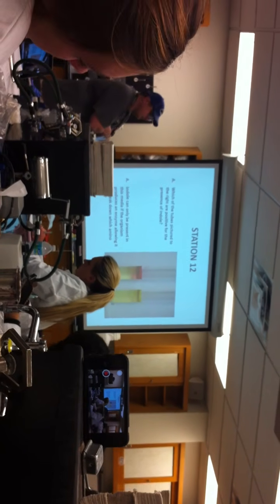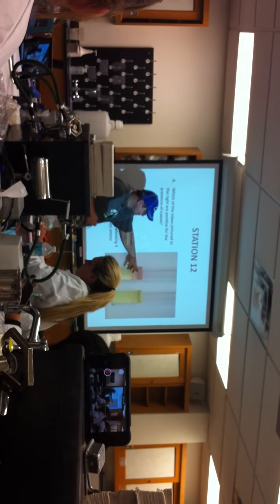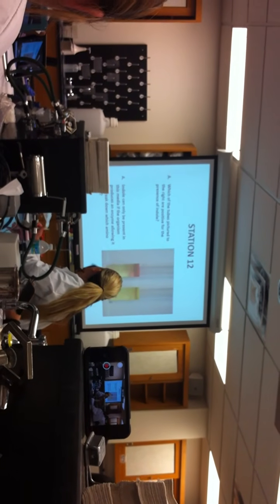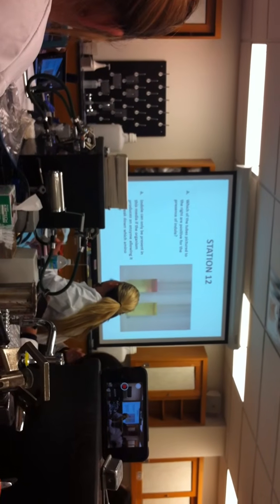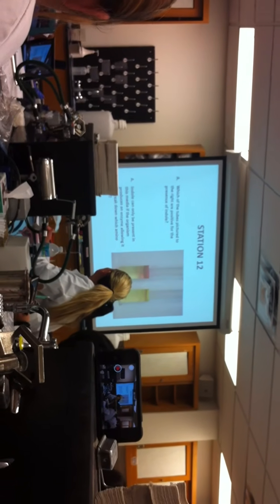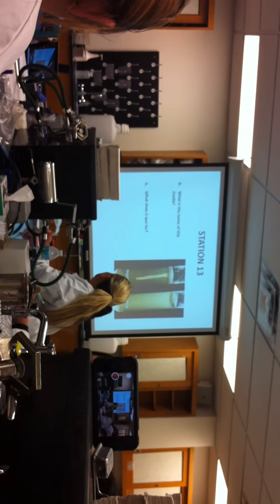Okay, you're looking for tryptophan being broken down, and that's where you get the indole positive from. So you're looking for the enzyme tryptophanase. That is the enzyme that breaks down tryptophan. If you know tryptophan, the enzyme that breaks it down should always be tryptophanase. All you have to do is add an -ase on something. That's the enzyme that kills it.